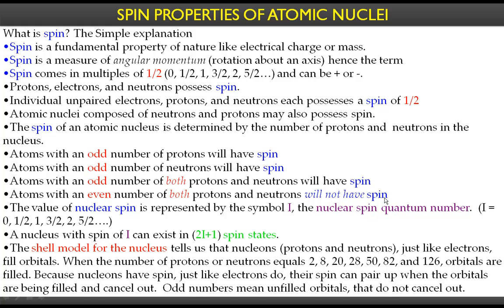They don't have a magnetic field of their own, so we cannot perturb the spin states, so we cannot observe them in an external magnetic field, that is the NMR instrument. It's one of the reasons why this particular tool is not applicable to all nuclei. Only certain nuclei can be observed in NMR spectroscopy.